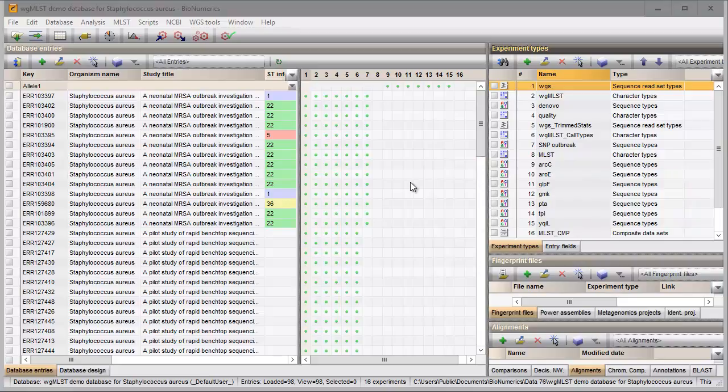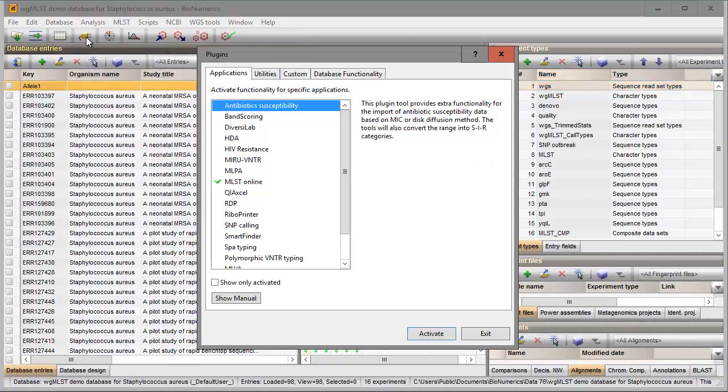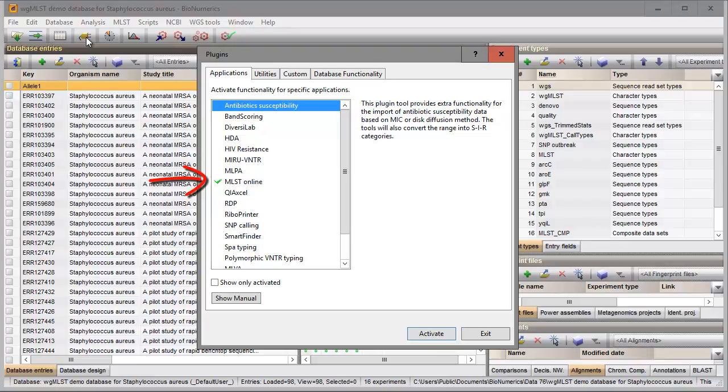Installing a plugin is done in the plugin dialog. The green checkmark indicates that the plugin is already installed in this database.